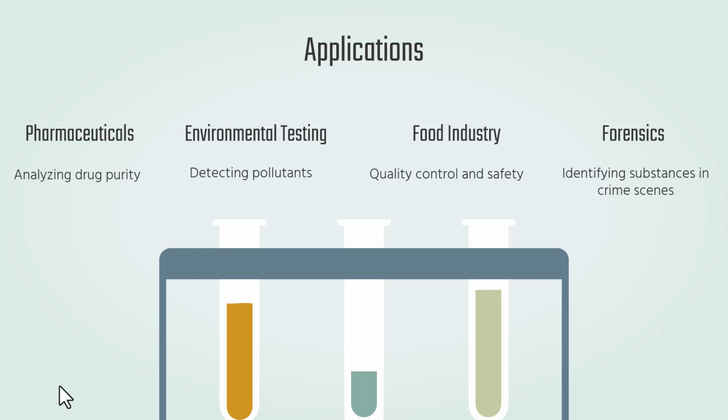In forensics, this is one of the coolest applications. Chromatography helps to identify substances at the crime scene, such as drugs or toxins, which can be crucial in solving cases.